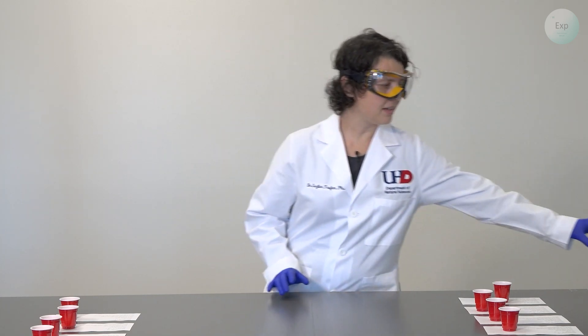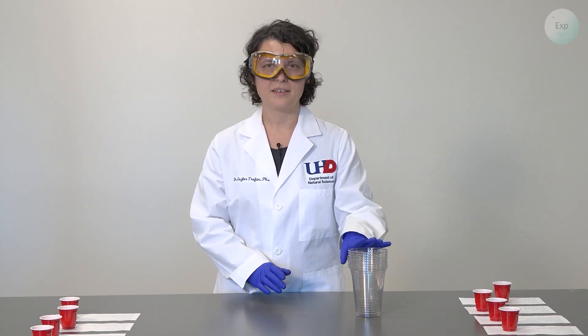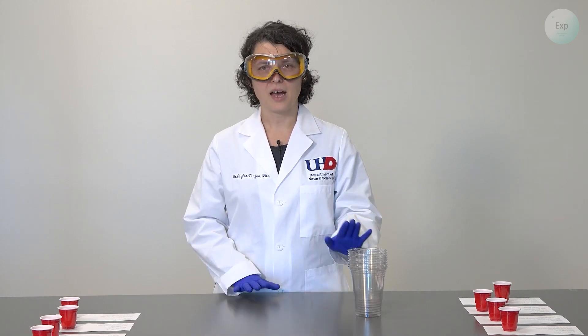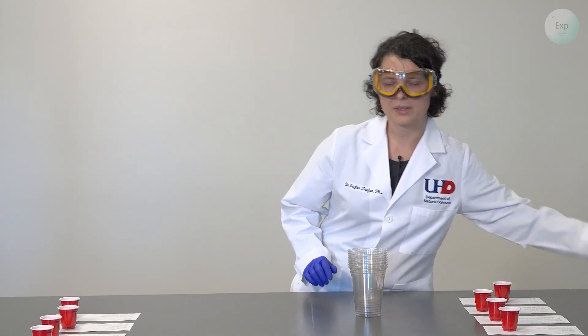The first thing we're going to need is something to contain our solutions in, and I'm going to use eight clear cups for that. We'll also need to know the mass of our cups and the mass of our combined solutions, so we're going to need a scale.